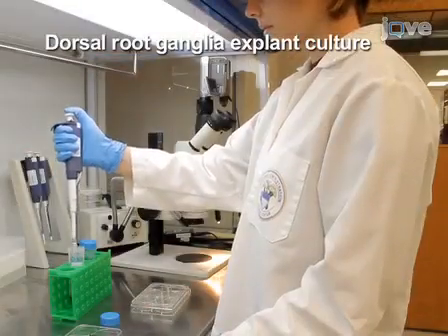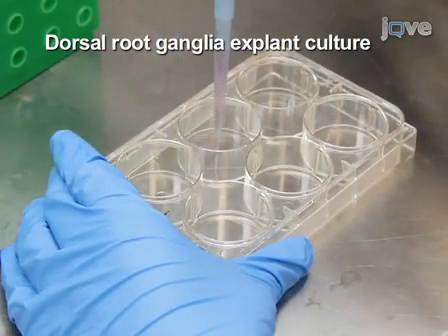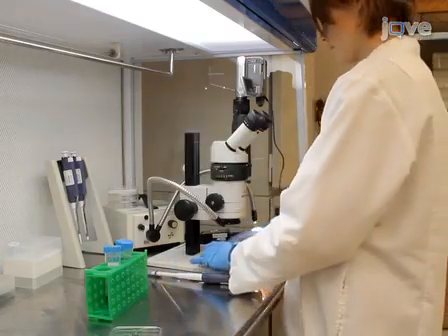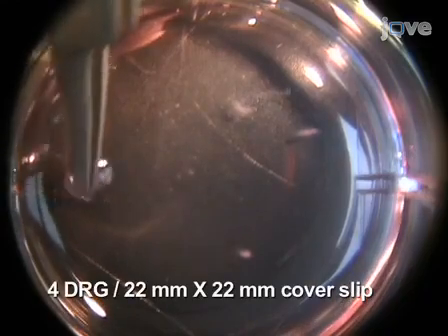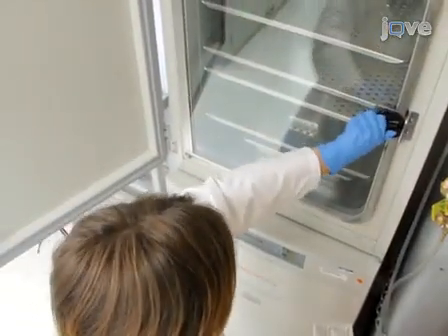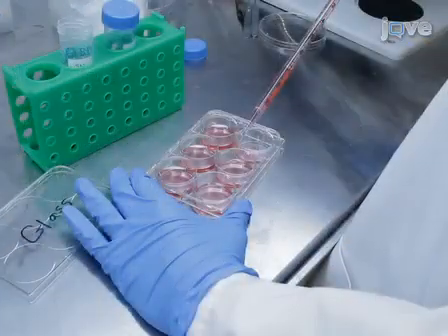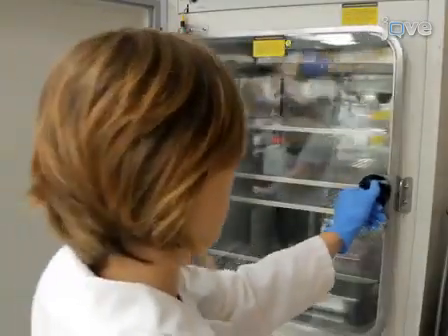To culture dorsal root ganglia explants, cover the protein-coated electrospun fiber substrates with a few drops of media. Then, add dorsal root ganglia to the medium. Arrange the dorsal root ganglia so that they are evenly distributed across the substrate. Approximately 4 dorsal root ganglia will fit on a 22 by 22 mm cover slip. Place the dorsal root ganglia cultures in the incubator at 37 degrees Celsius and allow them to adhere for at least 4 hours. Following the incubation, flood the wells with media and return them to the incubator.